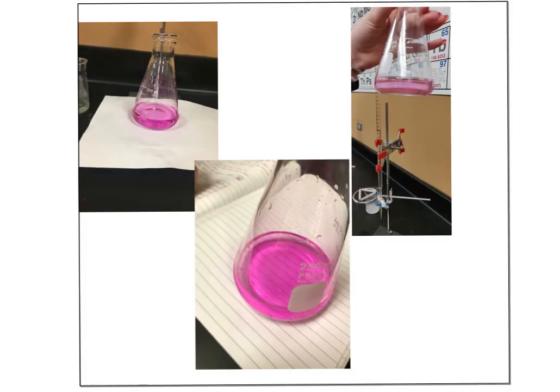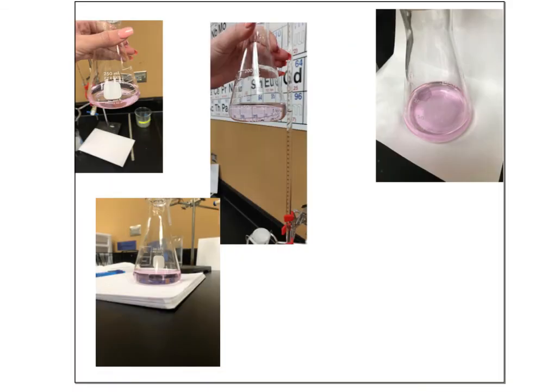And then I just wanted to pay tribute to some of our very first titration efforts. I got some, as Mr. Charvella calls it, some unicorn pee in some of these guys. We kind of overshot maybe our equivalence point a little too pink for what we like. But don't worry, after our first trial, some of our groups got there a little bit better here. So we were making some progress.